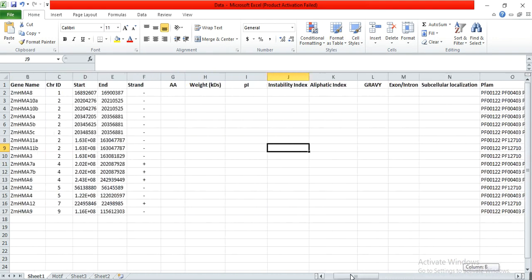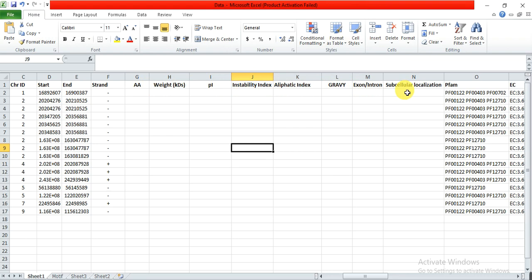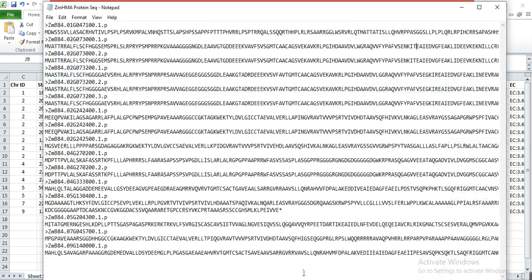From the GFF file and the gene annotation file. In this video we will try to find out the total amino acid number, its weight, isoelectric potential of each protein, instability index, aliphatic index, GRAVY, exon-intron ratio, and subcellular localization prediction. First we have to open our file that contains the transcript IDs.